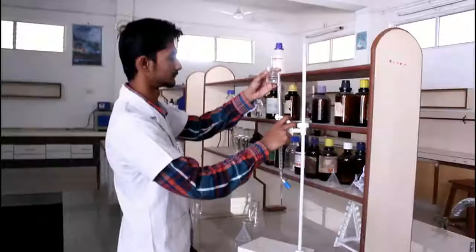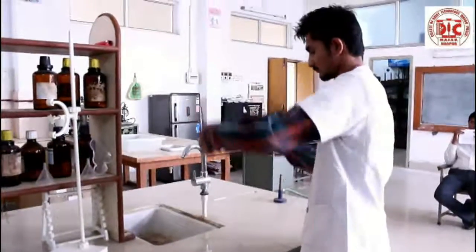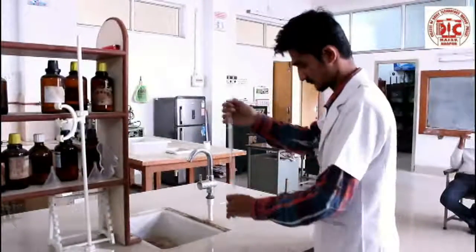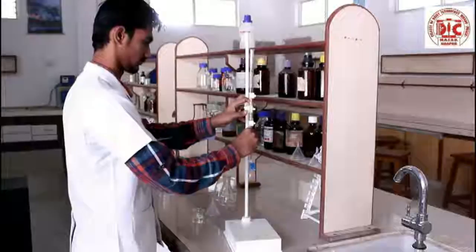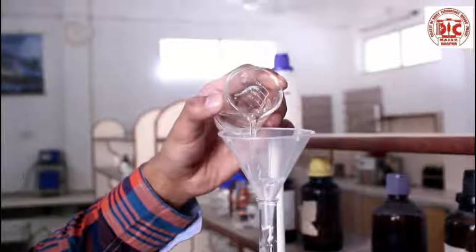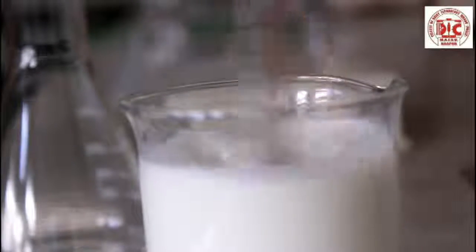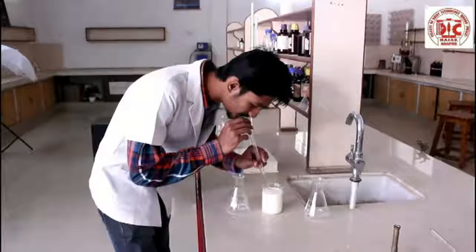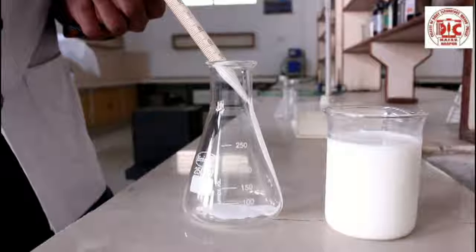Procedure: rinse the burette with 0.1 normal NaOH. After rinsing, fill the burette with 0.1 normal NaOH with the help of a funnel. Adjust the burette reading to 0 mark. Thoroughly mix the sample of milk, avoiding incorporation of air bubbles, and transfer 10 ml with the pipette to each of the 2 conical flasks.